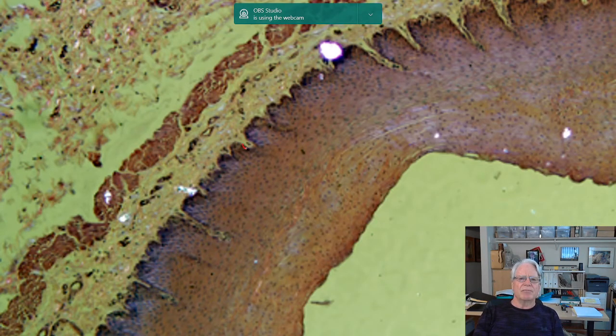Same story. There is the basal surface. There is the outer edge. And there is my band, thick band. Okay, and here there is no real way to see the distinct cells. So what you're going to have to depend on is this pattern. This dark edge, and then that edge, and that thickness. Stratified squamous epithelium.